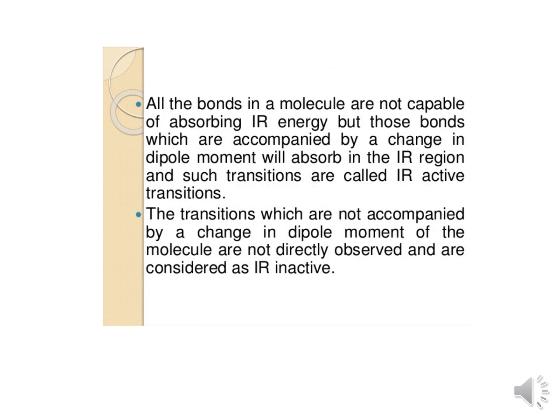All the bonds in a molecule are not capable of absorbing IR energy, but those bonds which are accompanied by a change in dipole moment will absorb the IR radiation. So this is a very important condition in IR spectroscopy. The transitions which are not accompanied by a change in dipole moment of the molecule are not directly observed and are considered IR inactive.